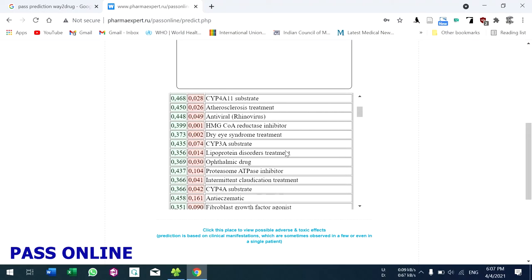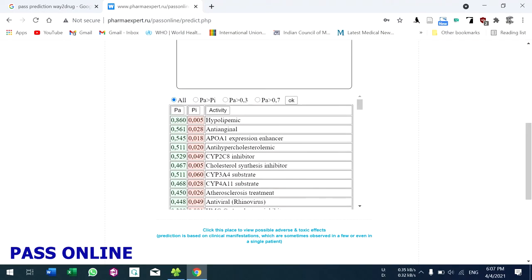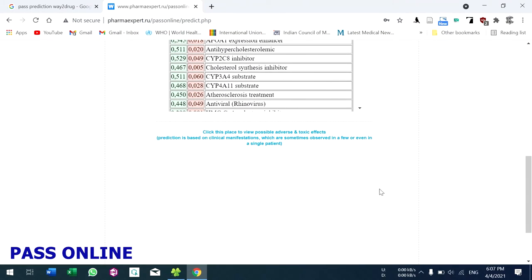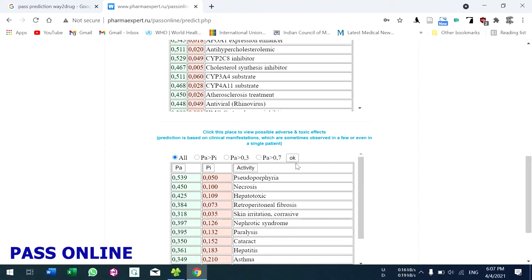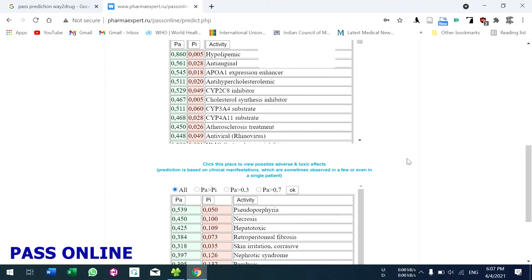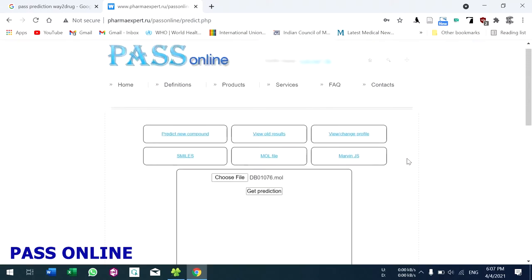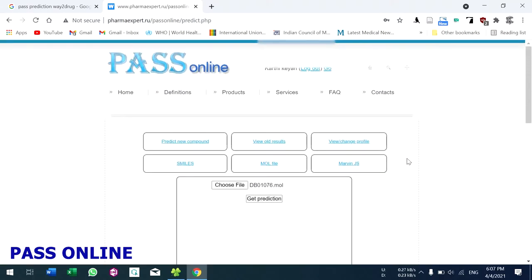These are the results. Both are the same compound, so we are getting the same results. If you want adverse reactions and toxic effects, click here and you will get these results. That's all for PASS Online.